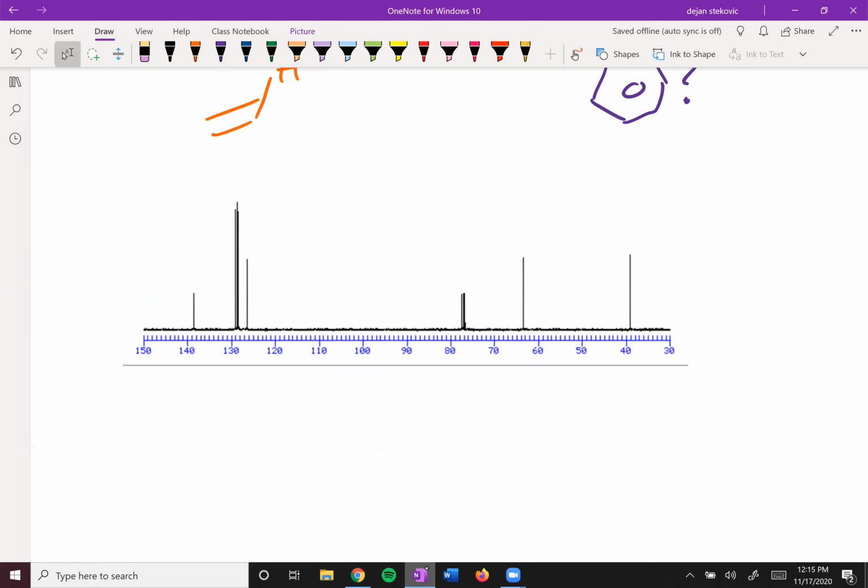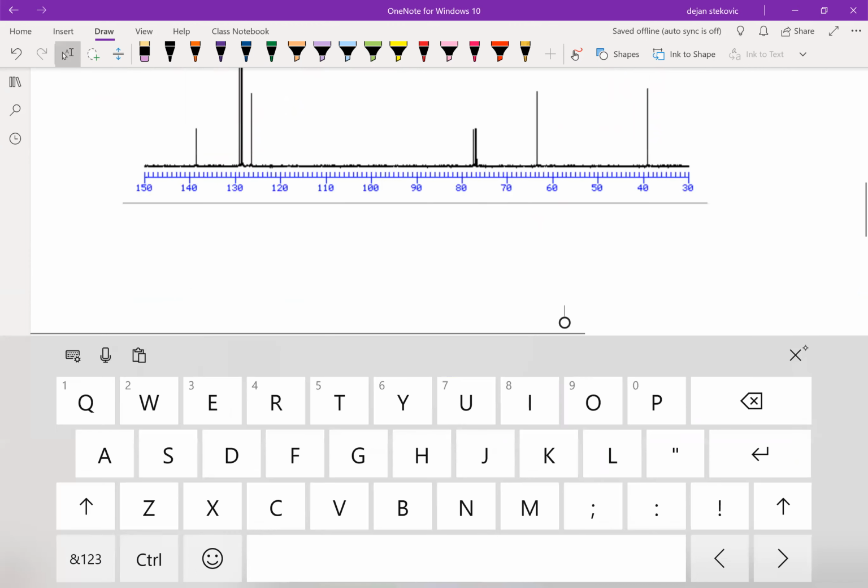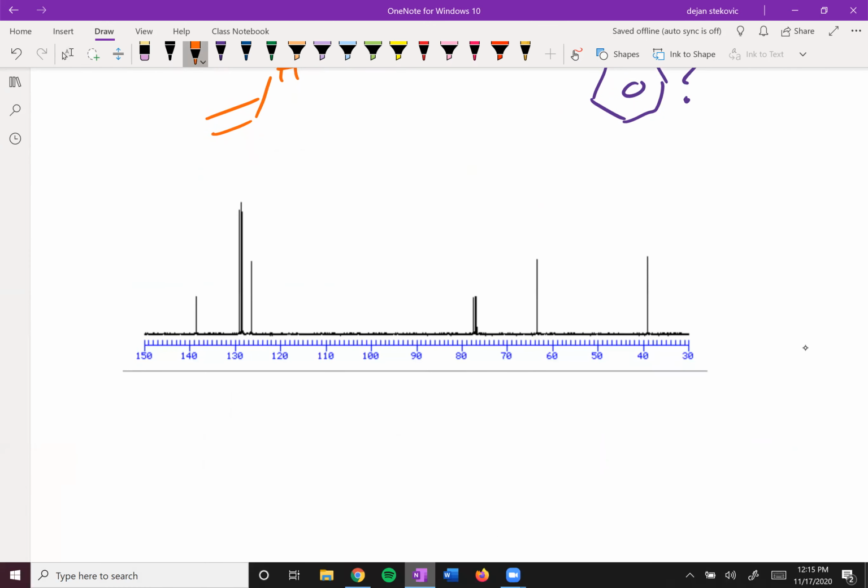So I think pretty much all of these NMR spectra have been taken in a solvent of deuterated chloroform. And the solvent peak from deuterated chloroform shows around 77. And it's 3 peaks for the solvent, right? So always ignore this kind of triple peak here. And so we've got 1 carbon here, another carbon there.